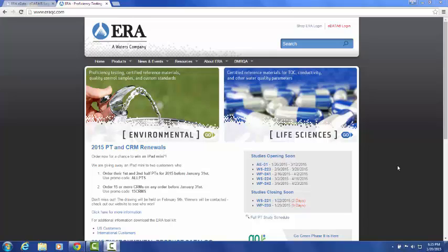Welcome, and thank you for joining us today to preview ERA's new eDATA PT portal, which launches on February 16, 2015. This is the first of two webinars to preview eDATA 2.0.